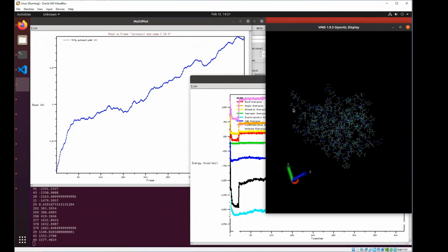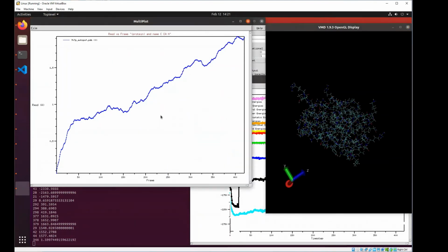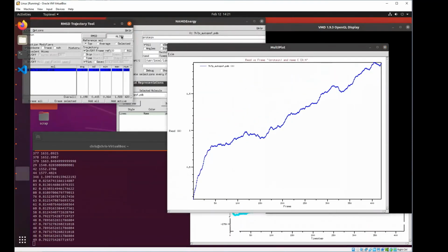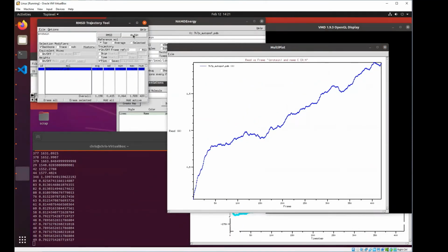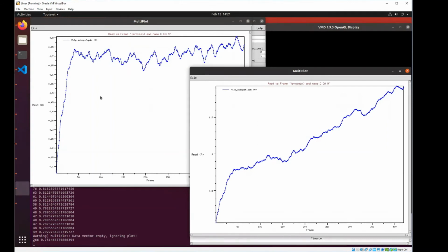And Chris, if you want to exhibit this one, go back to your backbone RMSD. Leave that one up. That would be a useful thing to compare it to. Just, yeah, that window. Align everything and then compute. There you go. Align and then compute backbone RMSD. And you can see now that by removing translation and rotational contribution to your molecular perturbation, if you ask the question from the internal point of reference of the molecule, how much is structure changing?